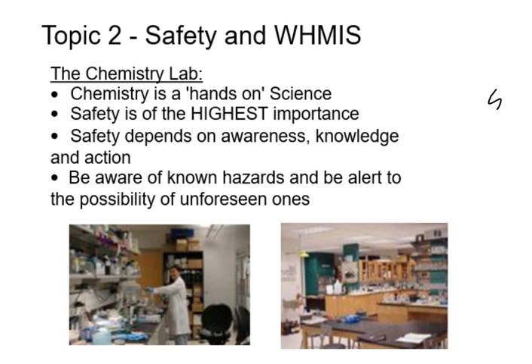I can't even describe it here, but I think this right here in the diagram is a fume hood. It's basically like a big container where you lift up the glass lid, do the work inside, and then close the lid so that if it explodes, you're protected. That makes sense? I've got a couple of pretty cool labs we're going to do where it makes a bit of a bang. But I just want to remind you guys that we do need to make sure that we're being safe whenever we're in the lab. That is an important consideration. But this is kind of an oddball topic. I'm going to tell you some safety words, and again, just memorize them.